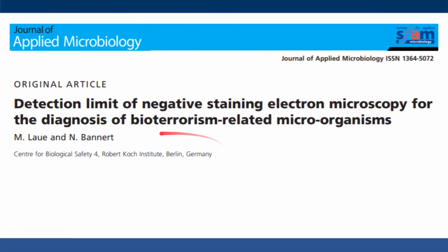The group from Germany proved that this is a very valuable technique that they can use to diagnose microorganisms from episodes of bioterrorism-related situations.